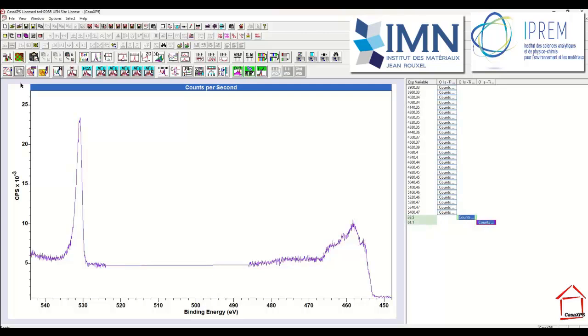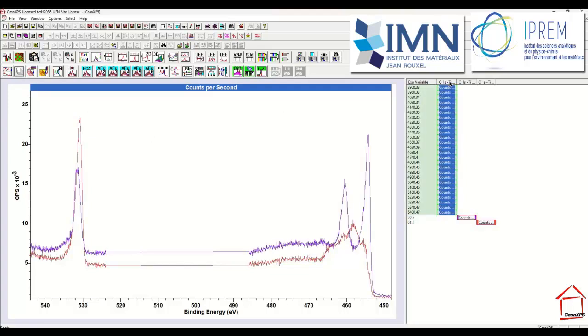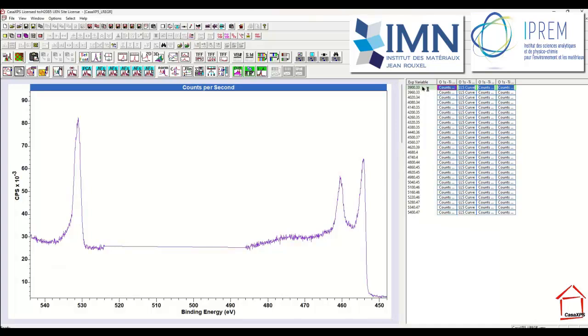So when I overlay these component spectra here, I can then compare these two spectra in different proportions that are calculated in a least square sense to the spectra that I have in this column that's selected, using the linear analysis button. So I press the button and a new file will be created that contains the data, the two component spectra scaled, and the sum of the two component spectra in the least square sense so that they match these individual VAMAS blocks. So I'm going to perform that calculation, and we see the new file.